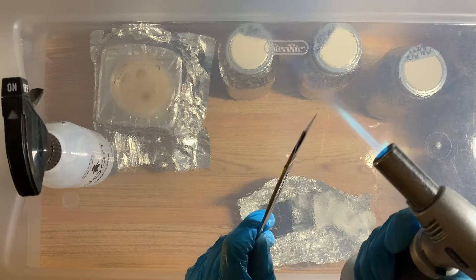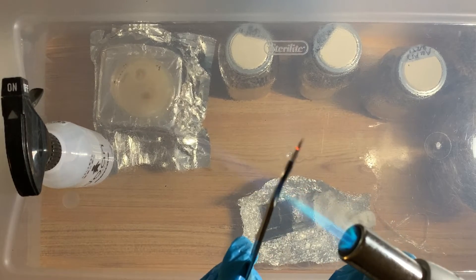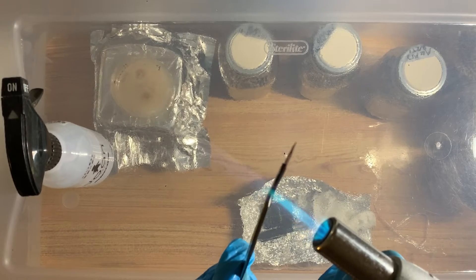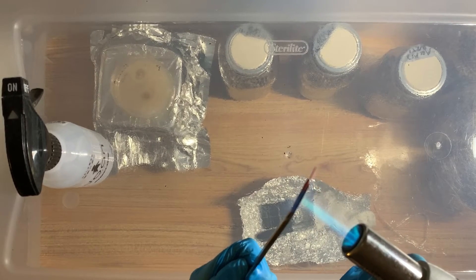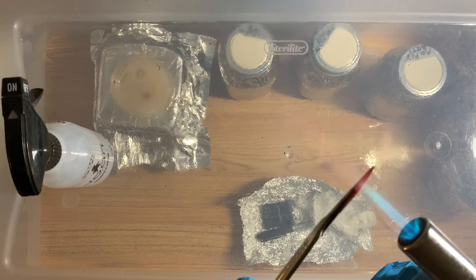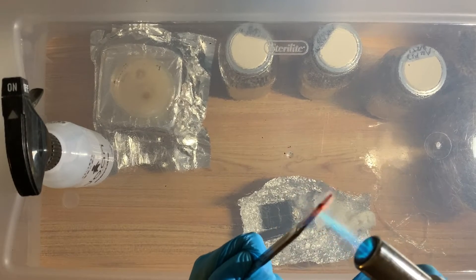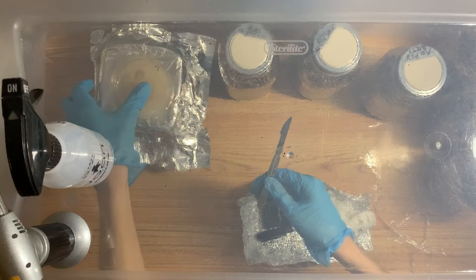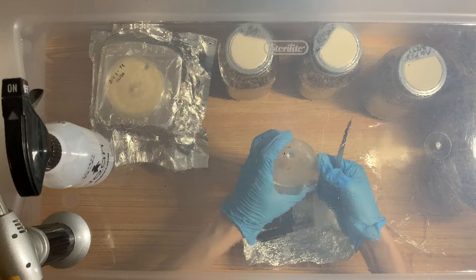Now I'm going to properly flame-sterilize the scalpel. The alcohol container looks close and dangerous, but the flame is actually far above the alcohol. I want to get it all red. Notice how I'm also heating up the scalpel holder itself — usually with plate-to-plate transfers I don't bother, but because I'm using wedges, the wedge can sometimes touch the handle, so I want to make sure that's also properly sterile.